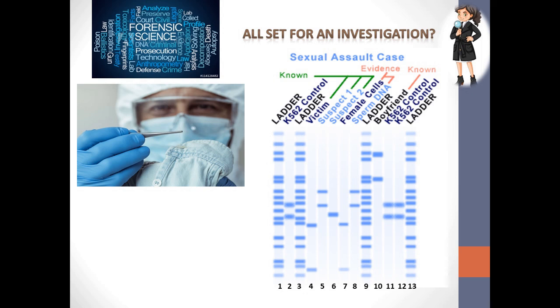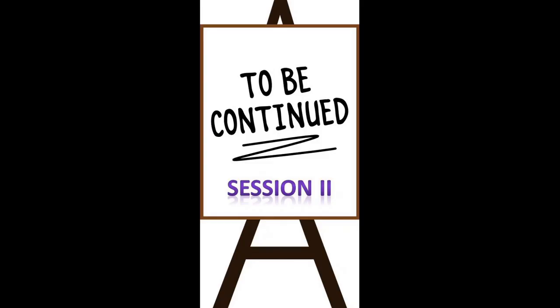Well, I assume you've guessed it correctly. It's indeed Suspect 1, since the RFLP pattern of the sperm DNA found on the victim matches with the DNA of Suspect 1. I do hope you found the investigation interesting.